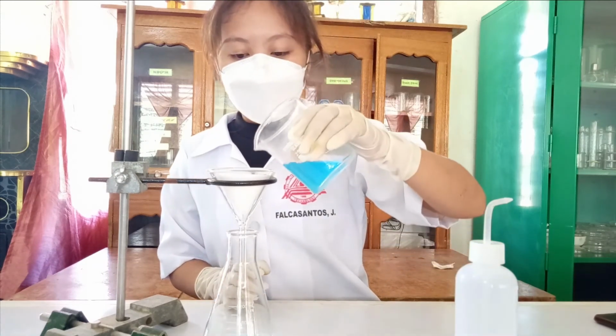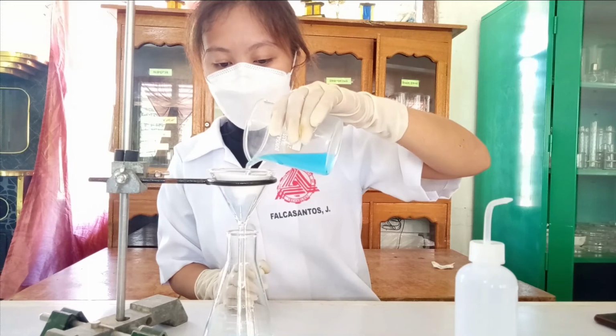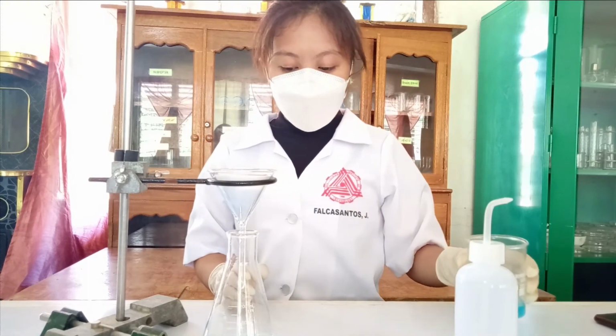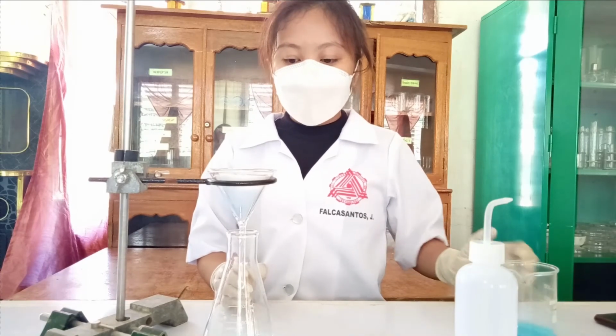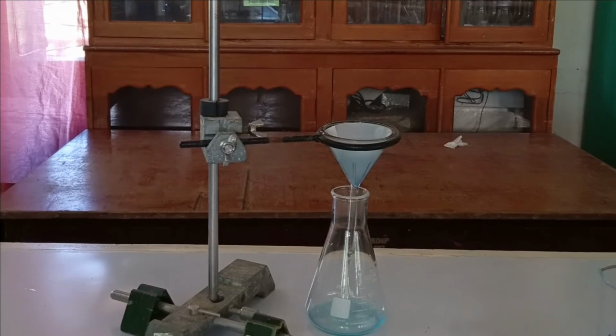Before filtering the mixture, allow the solid to settle to the bottom of the beaker. Then, carefully decant the supernatant liquid through the filter. This is done to prevent early accumulation of precipitate on the filter paper, which would slow the filtration process. Transfer the bulk of the solid during the last stages of the filtration process.